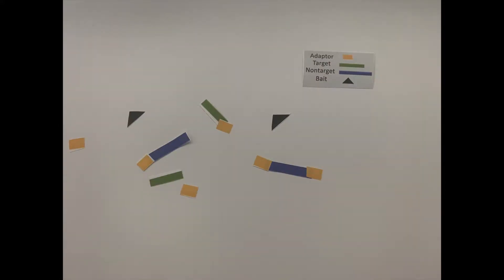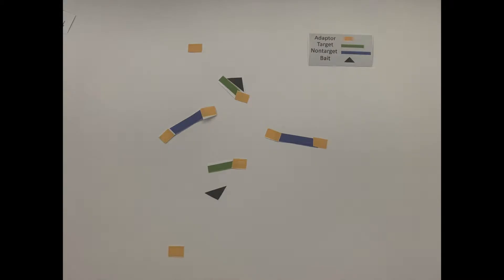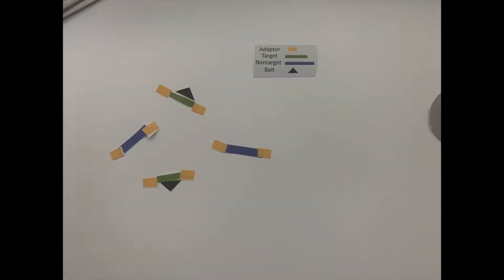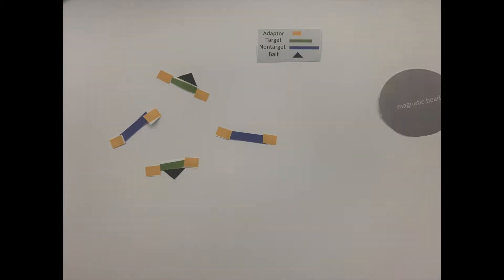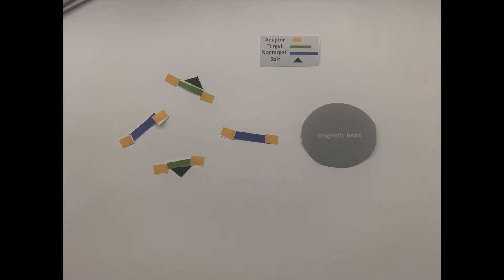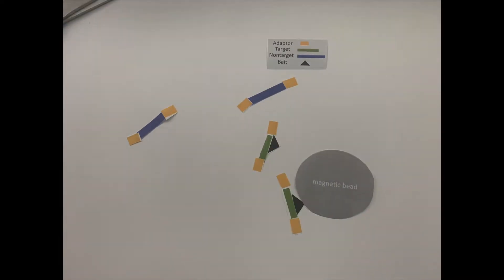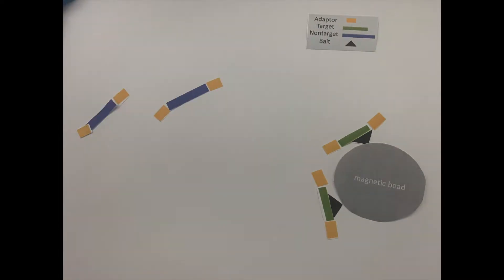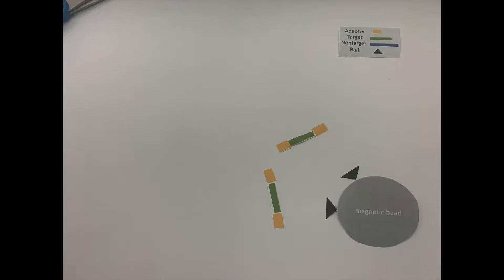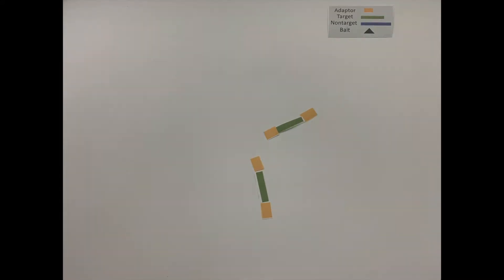Baits are magnetic probes that latch on to and identify your target DNA. Once everything is settled, magnetic beads are used to separate the target DNA from non-target DNA. The target DNA is then taken off the bead and put back into solution. It's then amplified and ready to be sent off to a sequencing facility.